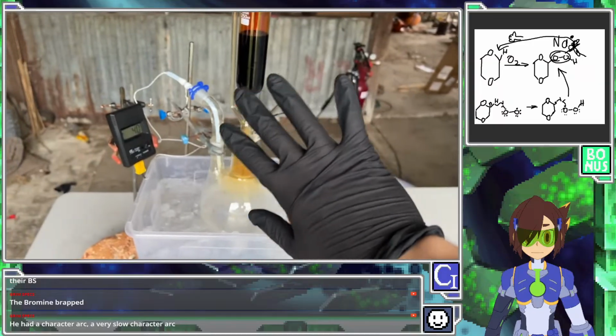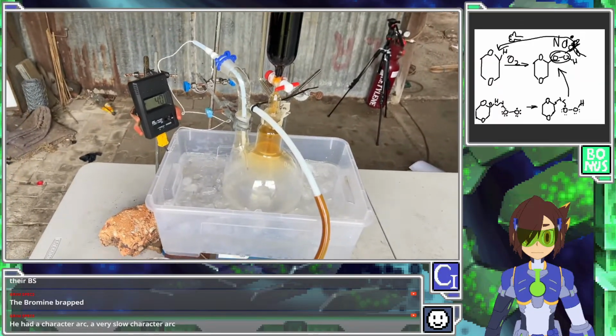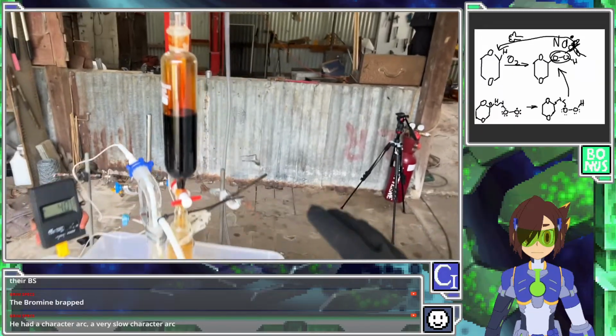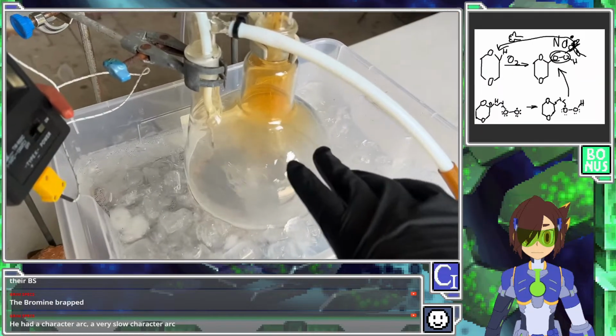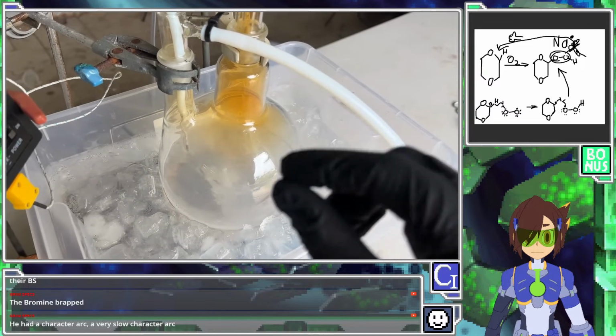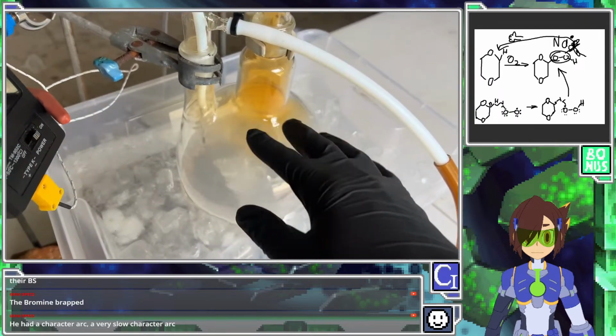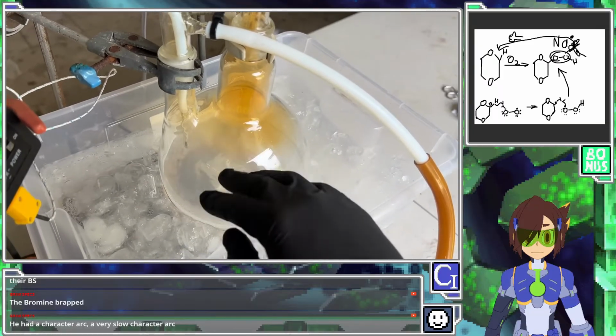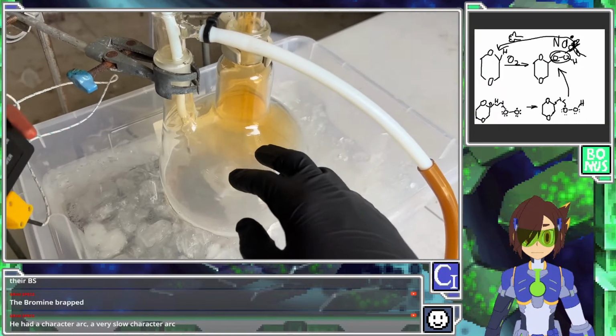Okay, here we are. It is much cooler. I had to wait about a week for the weather to actually cool down, but the room temperature is only about 20 degrees. So here we are. Here's the actual setup. We have everything in our flask as needed. We've got about 500 mils of DCM, which is a little bit skimpy. I'm always just a bit skimpy with solvent, but that's fine. Then we have our cyclopentanone ketal in there, as well as our dioxane.